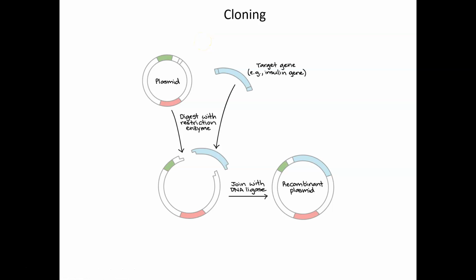And now I can tell you that what makes this a multiple cloning site, what makes this a region that we can insert DNA into, is that it just has dozens of different restriction enzyme sites in it. It's got an EcoR1 site, a BamH1 site, it's got the Taq site, it's got SalI, it's got dozens of restriction enzymes. So it's almost like a Swiss Army knife, an all-purpose insertion site that allows you to use whatever restriction enzymes you need to for your DNA of interest.